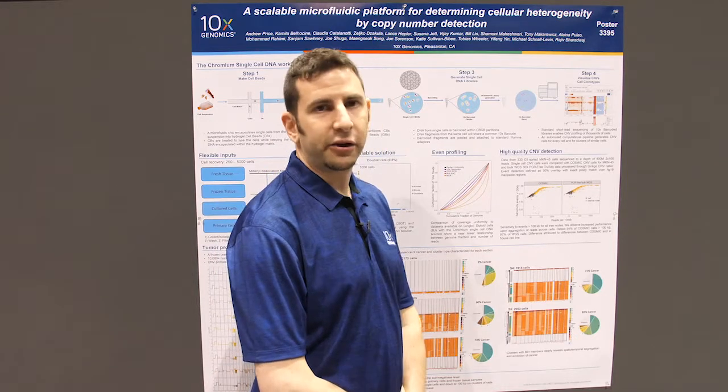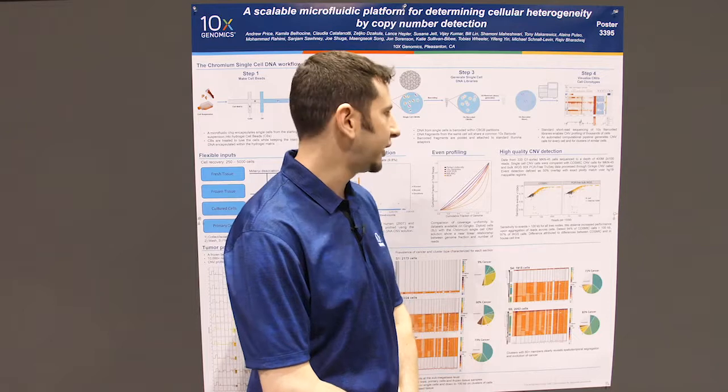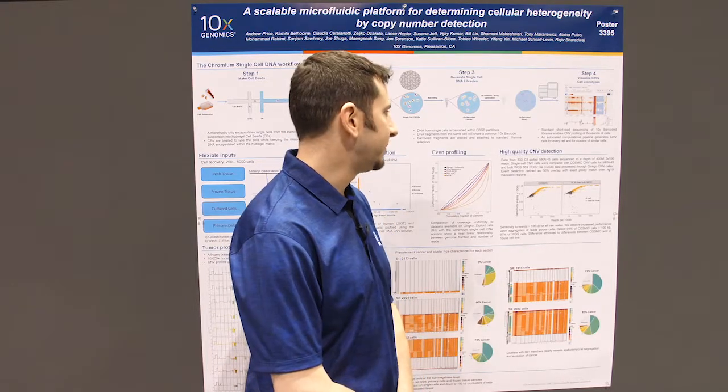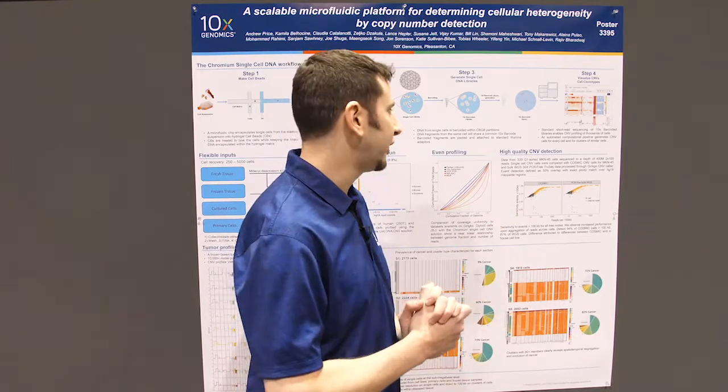Our platform allows copy number variation calling on individual cells, generally at the depth that we recommend sequencing to. You can call it to achieve a resolution of around 2 megabases on an individual cell. However, with clustering, we were able to achieve a resolution of 100 kilobases per cell.